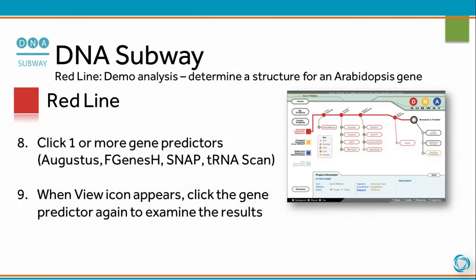Click one or more gene predictors. When the view icon appears, click the gene predictor again to examine the results.